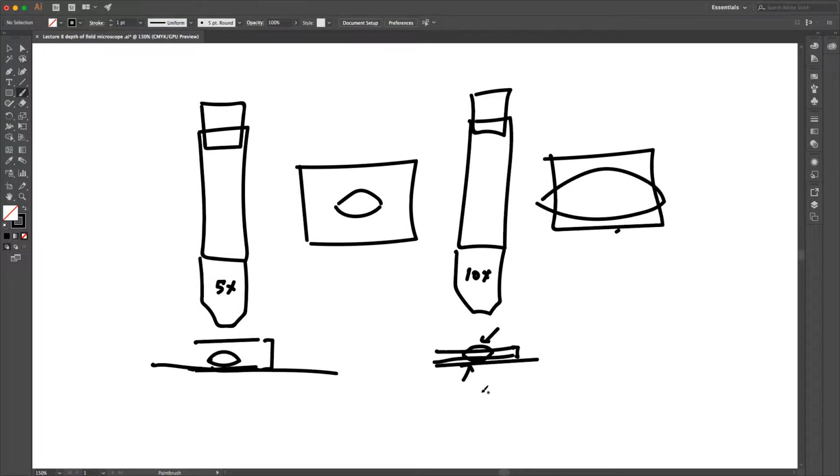So now, in this scenario, because the light is being transmitted through the sample, you have regions of in-focus light and out-of-focus light, and they stack one on top of each other in the final image. So you end up with some sharp information, but everything looks a little foggy because there's both out-of-focus light and in-focus light contributing to the final image.